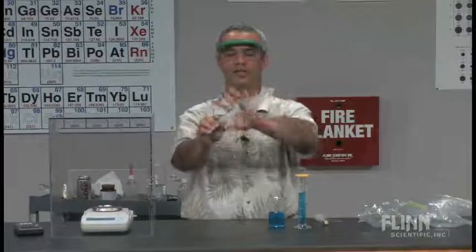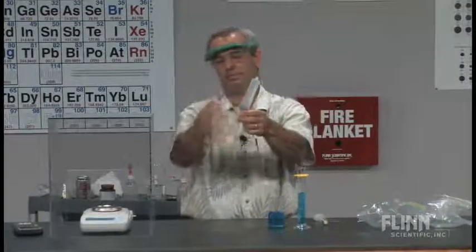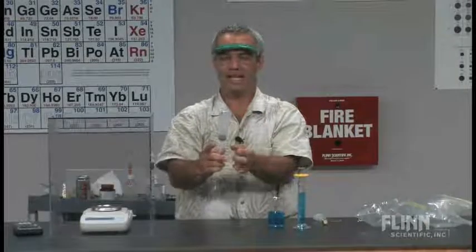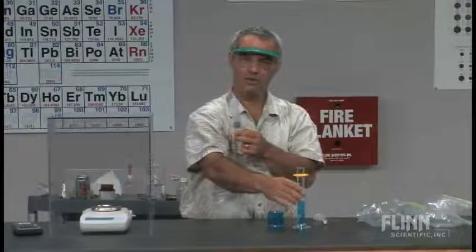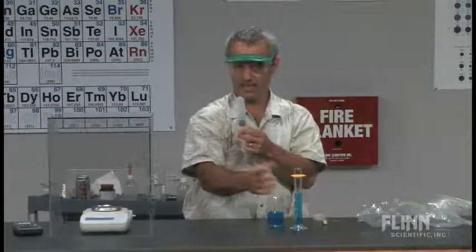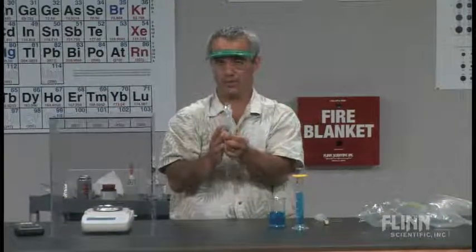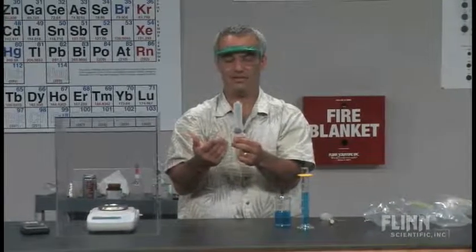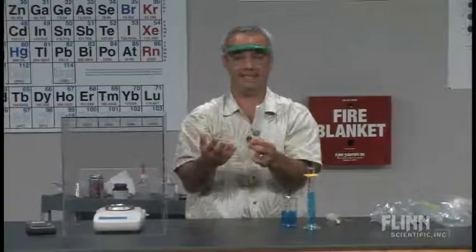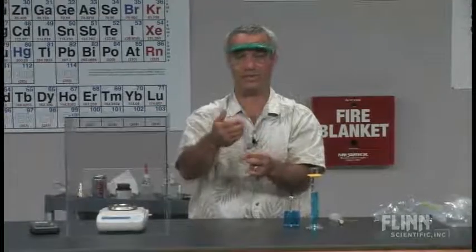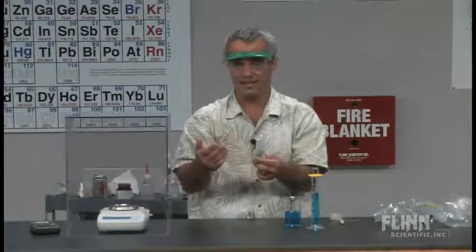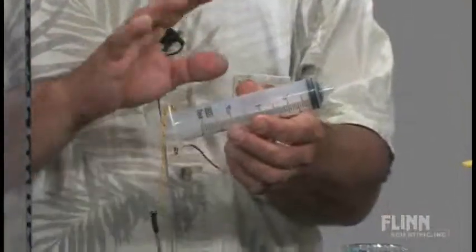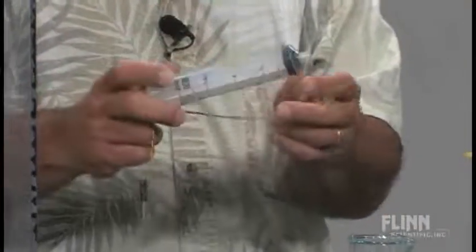So there is the modified assembly. I have 12 of these made up, one for each lab group. Now, when they did the liquid, they had to weigh the cylinder empty. Same here. We have to weigh the syringe empty. But what does that mean? I mean, is it empty now? Well, it is, and it's not. It's not empty if we consider the fact that there's air inside, and air has mass. So we have to create a vacuum inside to get this thing completely empty.